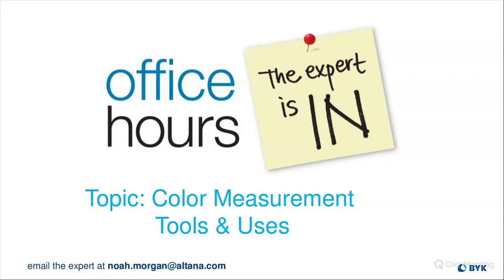That's just based on the finishing. And if you want to measure if there's anything changing with your raw material, the D8 is where that's going to play a role. But if you're going to start measuring stuff where your end user is going to see it in that form, and you want to match things in that way, that's where the 45-0 would be recommended. Okay, good. Thanks for clarifying that.